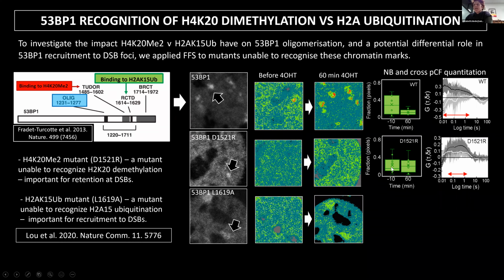And if we identify the foci based on 53BP1 intensity, not dimer localization, and we do a line scan analysis across that foci, we find the reason there isn't a redistribution of the dimeric population to these locations is because while they can arrive at these locations, there's a significant fraction that can get off the structure. And so this must lead to the lack of accumulation at these locations.